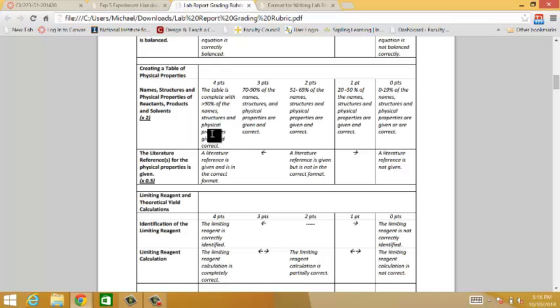Obviously, if you're going to take a melting point, the literature melting point would be a physical property. But let's say I was to do rotary evaporation. I need to know what the boiling point of the solvent is and the boiling points of the compounds I'm isolating, so that I know that the rotary evaporator, number 1, is hot enough to remove the solvent, but number 2, not hot enough to actually boil the product that I'm trying to collect.